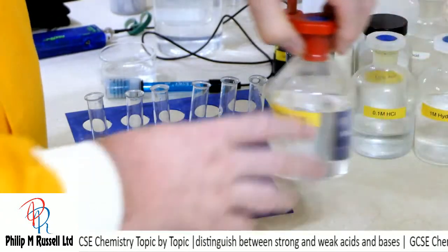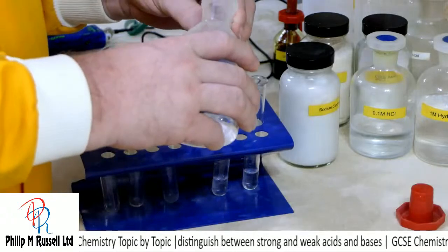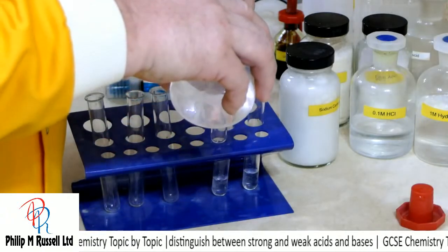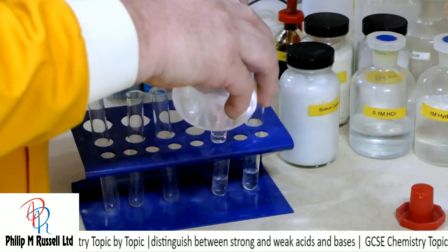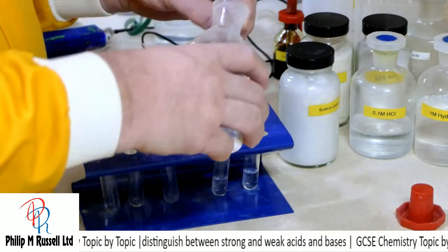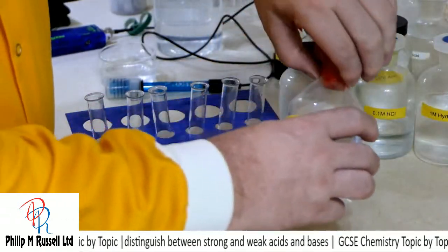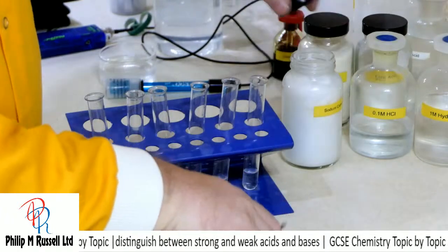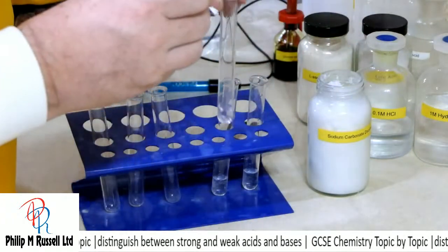Let's try hydrochloric acid. Again, I don't want to put very much in, but perhaps a little bit more than that. There we are. So I've got my hydrochloric acid, and I'm predicting it's going to be fairly similar.